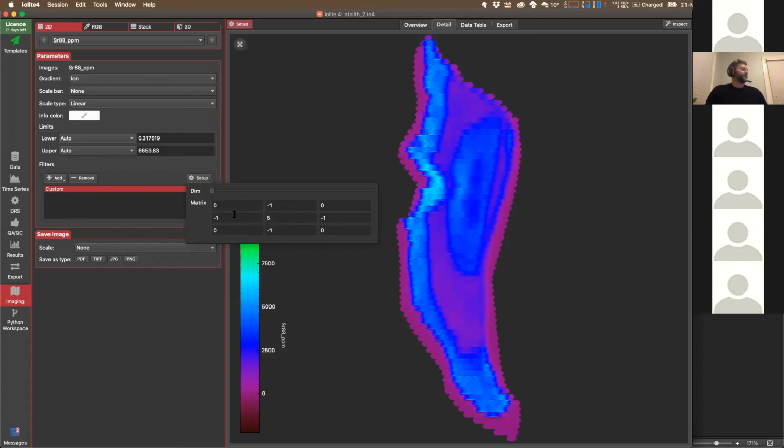But you can change the size of that, and you can type in whatever you like. That gives you a lot of freedom right there. So for people who are familiar with those sorts of image convolutions, then it's really quite cool.